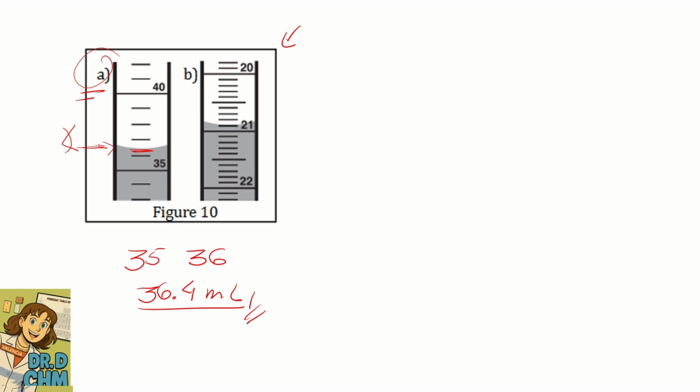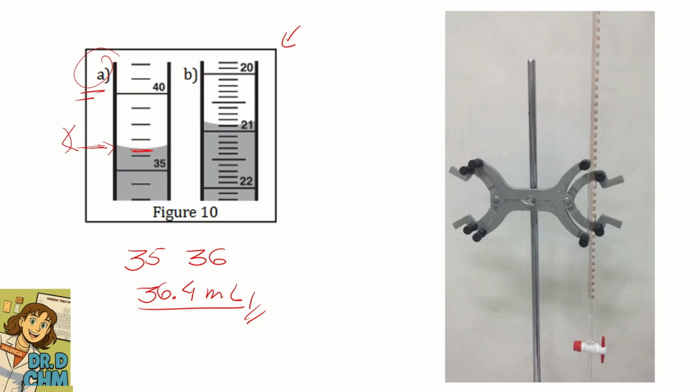That's why the number is decreasing, because it's telling you how much liquid is still inside. However, in this case we have a burette. A burette is an instrument that we use to measure how much liquid we have used, how much of the solution we have used, okay?